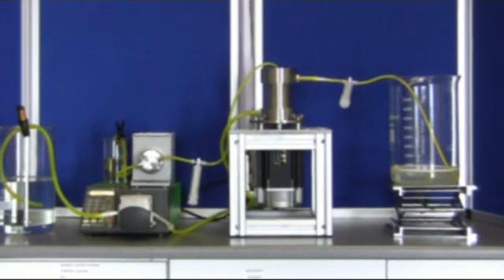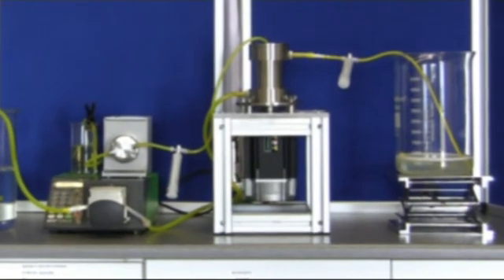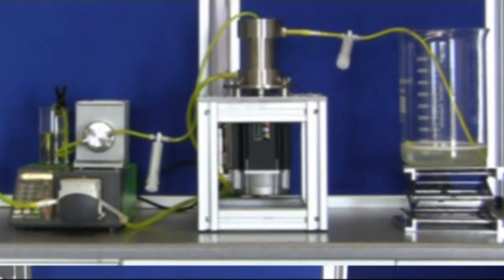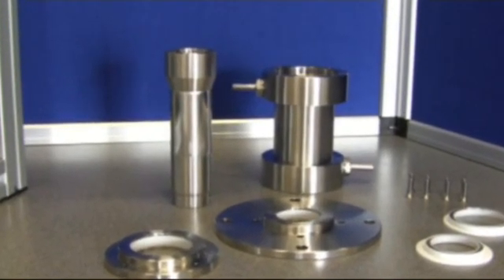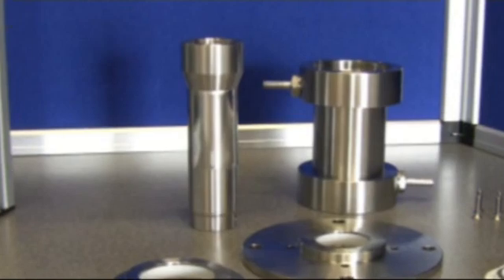If we focus in on the oscillating membrane system, it has components which are shown here, the most important one being on the left - that is our membrane.